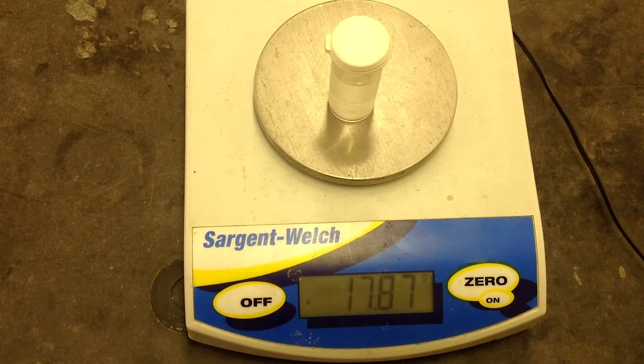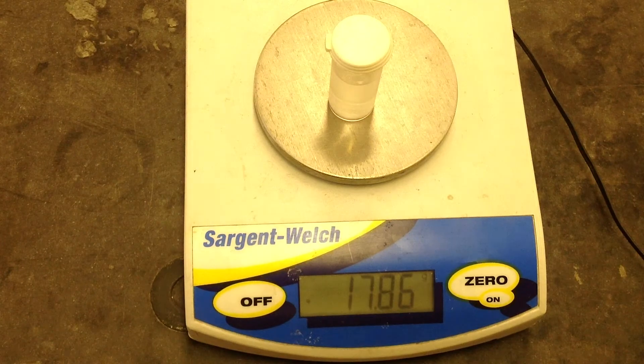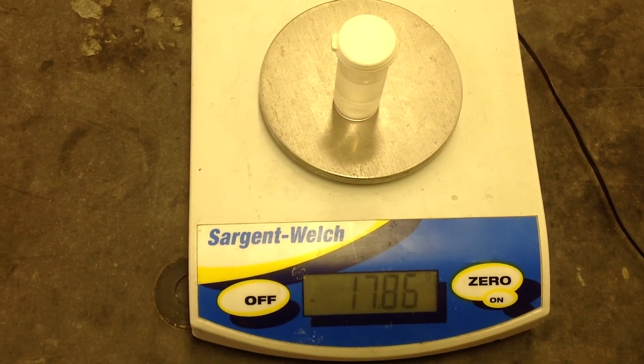And in this case, we can see the mass is now 17.86 grams. You can see that we recorded it here, and our change in mass is negative 0.04 grams. And that is what we'll do — we'll do a second trial of that as well.